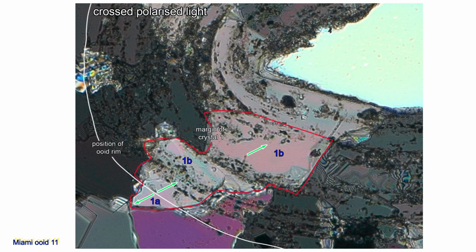Assessing inclusion support on a two-dimensional thin section image is difficult. So the last sample included here is of an ooid that underwent selective dissolution, but unlike ooid 11, was not subsequently cemented. So its inclusions must be self-supporting, however improbable this appears to be.